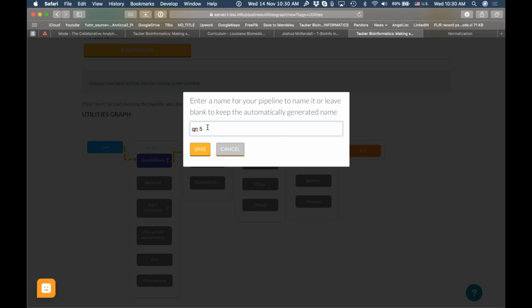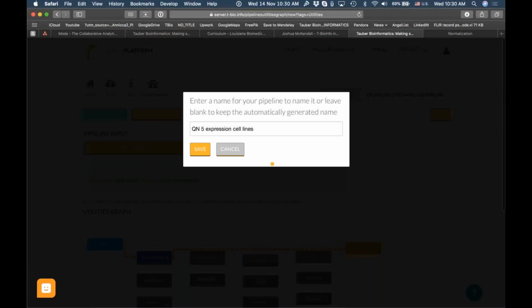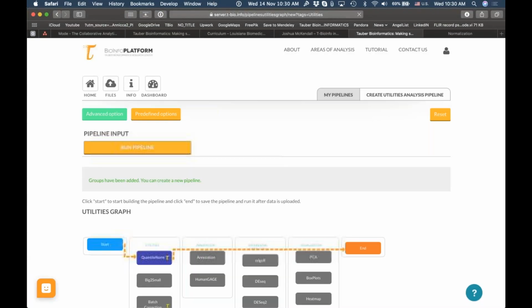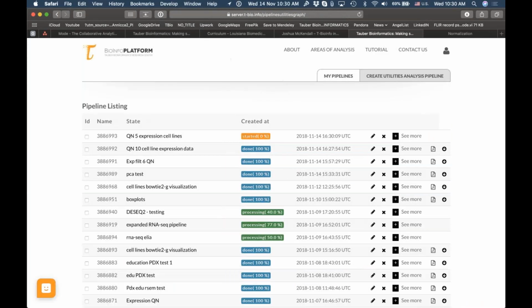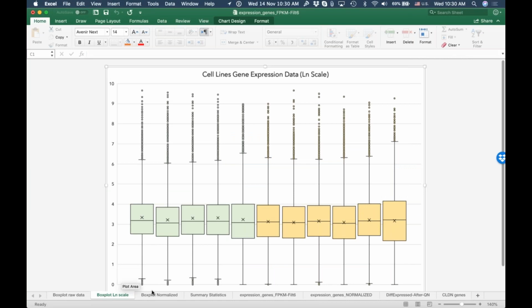So, you know, we can play around with this with the different parameters and see what the results would be. Okay. All right. So here we are running several pipelines. We'll take a look at the results. So what would happen if we leave our data as 0?